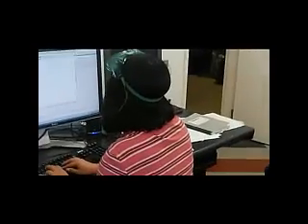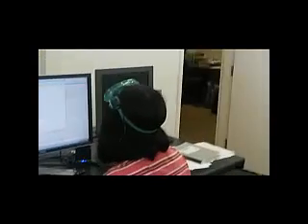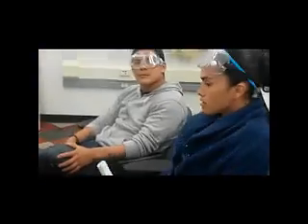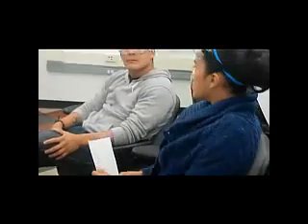So the idea, like I said, there are lots of different ways of doing this, but the idea is to have you just load up all your samples as a class and come back when it's ready. Or if you want, you can come in, load up the method, do the sequencing yourself, scan your samples, collect the data, and then log off. Done.